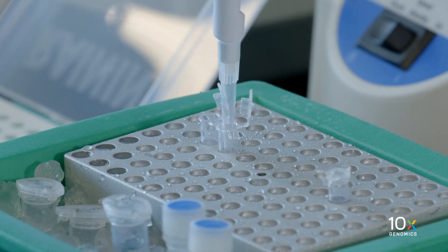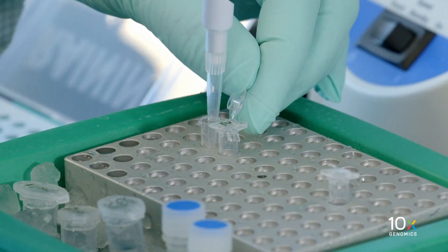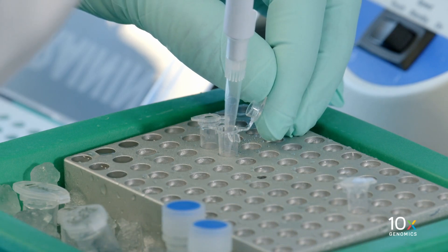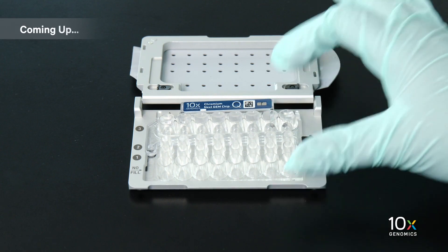On ice, add 35 microliters of prepared GEM master mix into each tube containing diluted sample. Place remaining undiluted sample on ice — samples should not be stored until after successful GEM generation. We have prepared the GEM master mix and diluted the sample. Next we will assemble the chip.